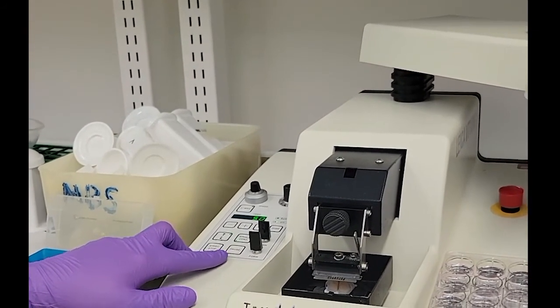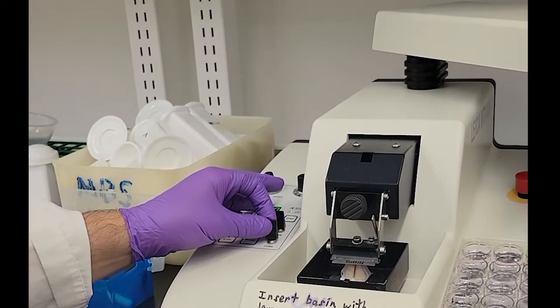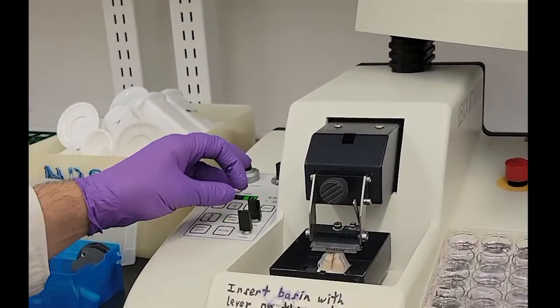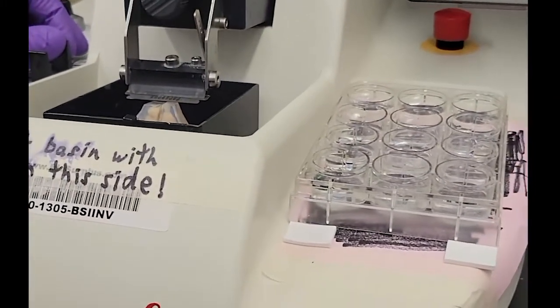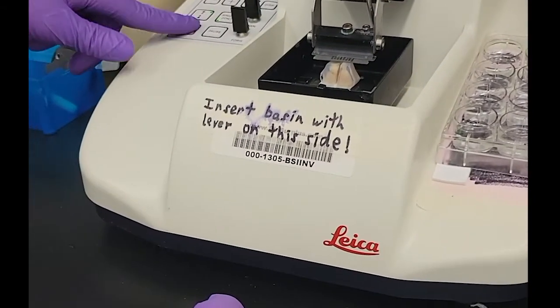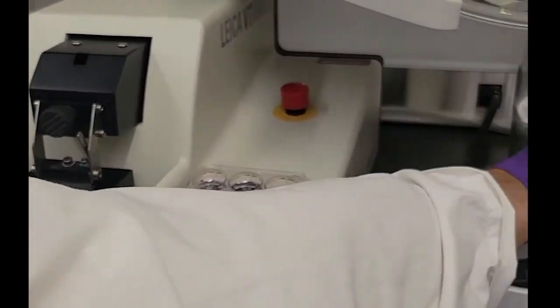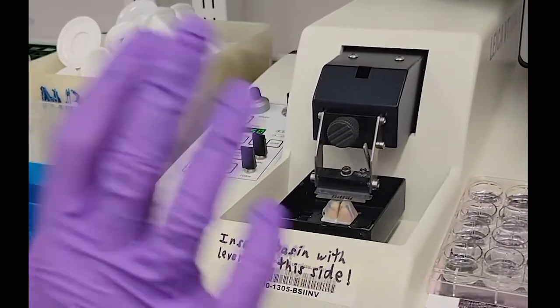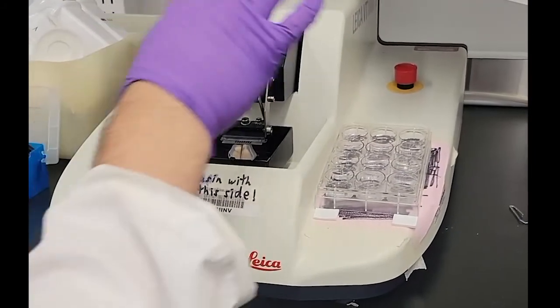Beyond that, if you need to raise it because it's not cutting the sections, we can do that. We bring the blade back directly over the middle of the agarose blocks and use the up function to find approximately where the blade is touching — not much further up from where we started. Then we hit start and it'll automatically begin running. We make sure to have a brush to sweep up sections. We don't need a large brush based on the size of these hemisected sections. For now it'll be cutting through the agarose for a little bit, so we'll ignore that.